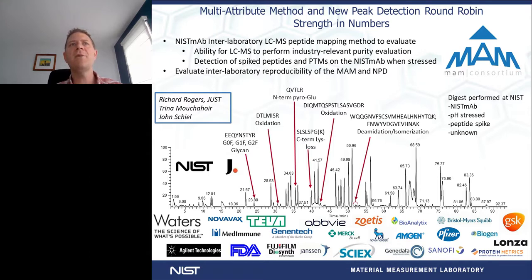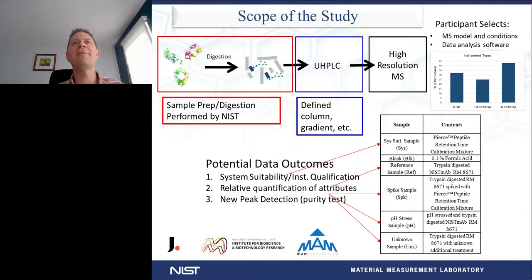So with this, we worked with Rich Rogers, now with Bristol Myers Squibb, to organize a combined multi-attribute method study. Trina Muschauer is a colleague of mine at NIST that's been leading this study from the NIST side. And then again, Richard on the BMS side has also been helping, along with the MAM consortium, which we recruited approximately 30 members throughout industry to essentially run the same multi-attribute method, come back together, discuss their results, and understand what our current capabilities are for performing this analytical method.